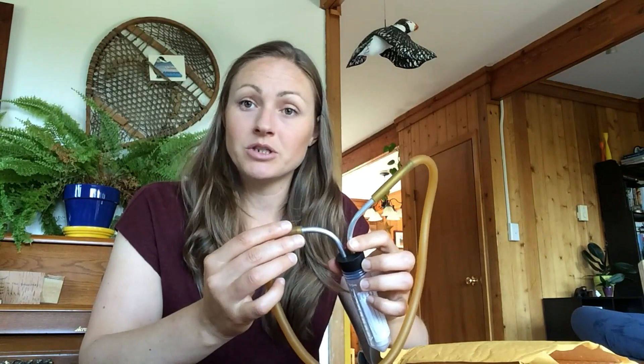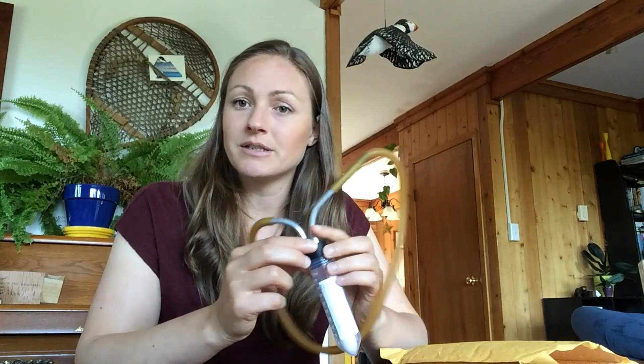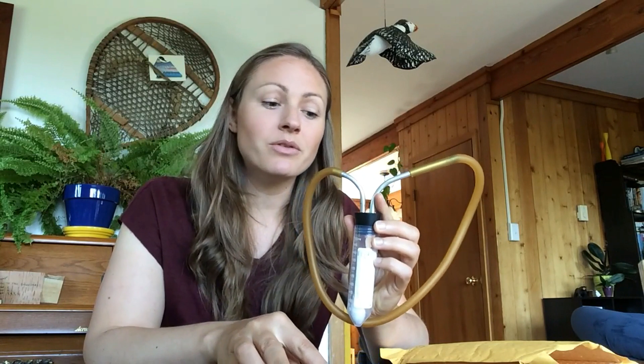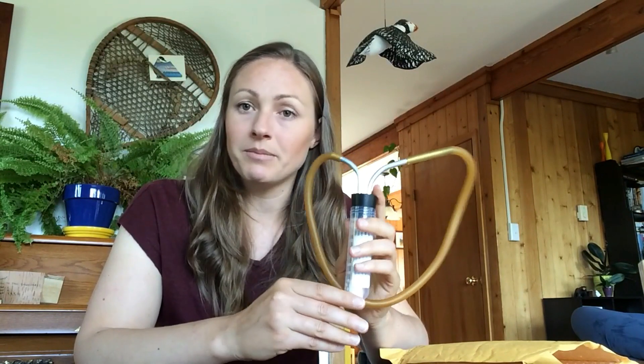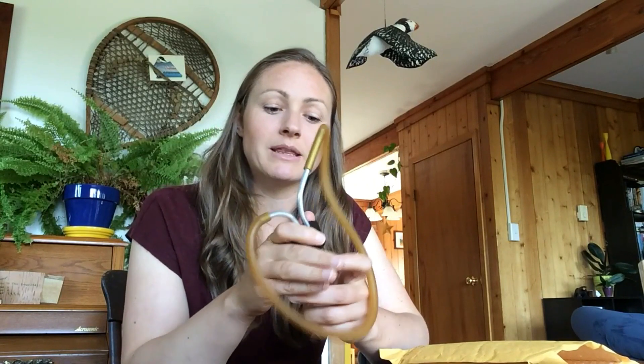Now sometimes, say if you do want to switch tubes, you'll see that the mosquitoes are flying around and it's hard to take this off and put the lid on so that you can use it on a different collection tube. So another thing to do is just stick this in the fridge or the freezer so that the mosquitoes calm down, and at that point it might be easier to switch and put the lid on. If you feel comfortable switching it quickly, that works too — but you can always put them in the fridge or freezer to calm the mosquitoes down first before you change.